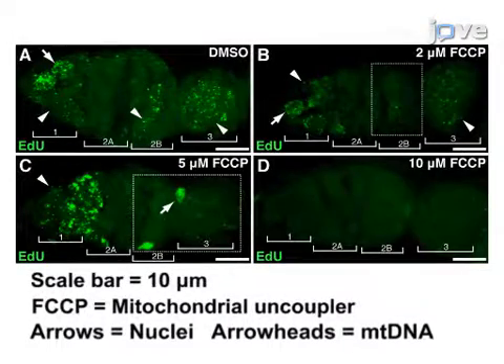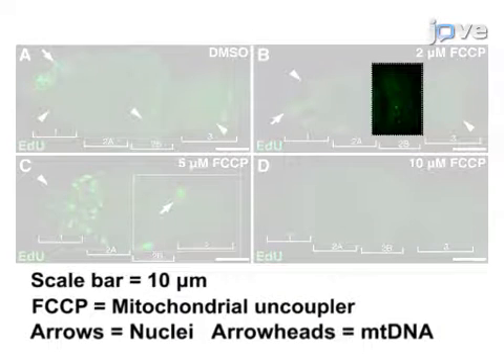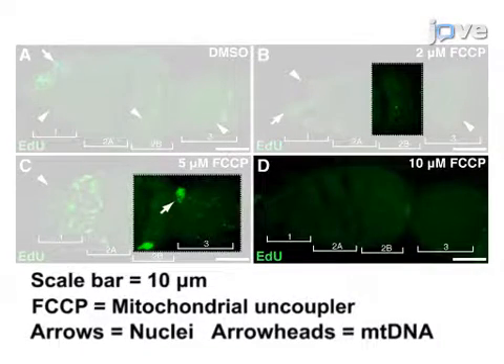When wild-type germaria are treated with a mitochondrial uncoupler, FCCP, at varying concentrations, mtDNA replication is impaired. This is corroborated by a reduction in EDU staining as seen in the 2 micromolar, 5 micromolar, and 10 micromolar treatments. Following this procedure, simple quantification of mitochondrial DNA replication under various genetic and pharmacological perturbations can be done.